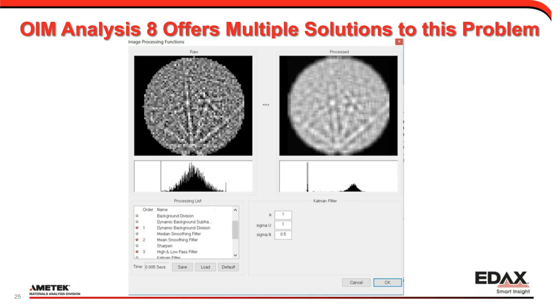So just go ahead and click on this, and I'll show you where you click on this in a bit. Again, there's a whole bunch of different tools built in here to actually play with and get the contrast and the patterns that we need after we've already collected the data.